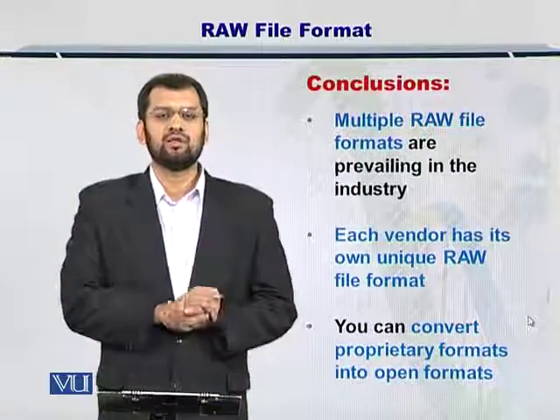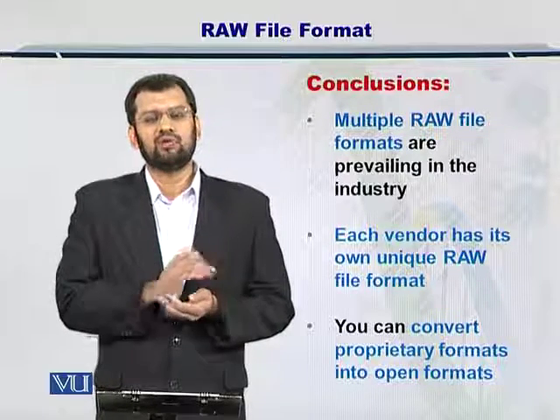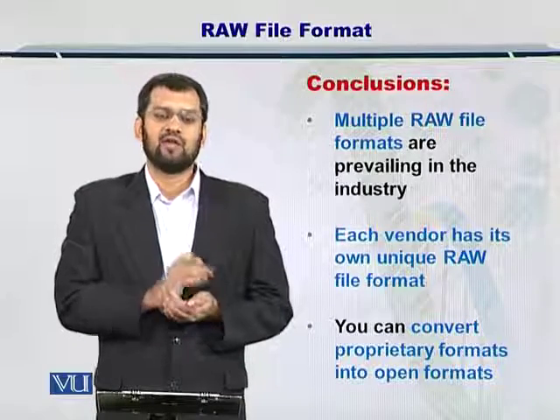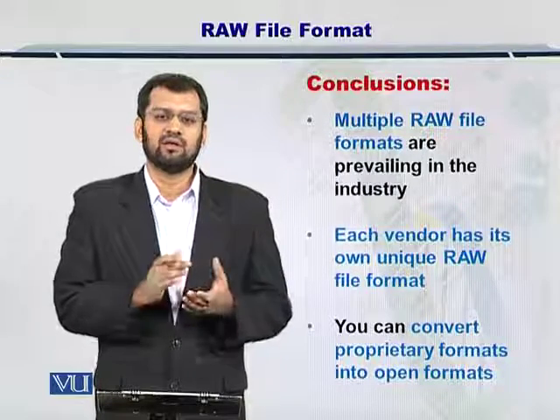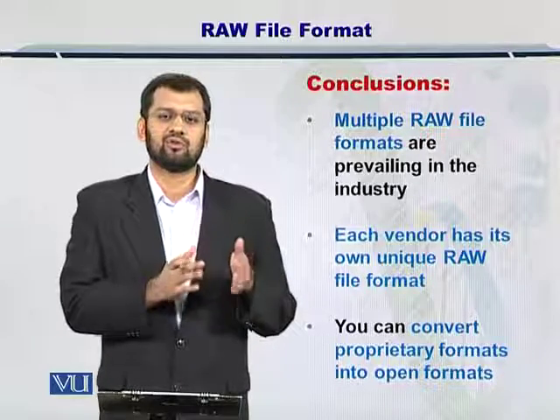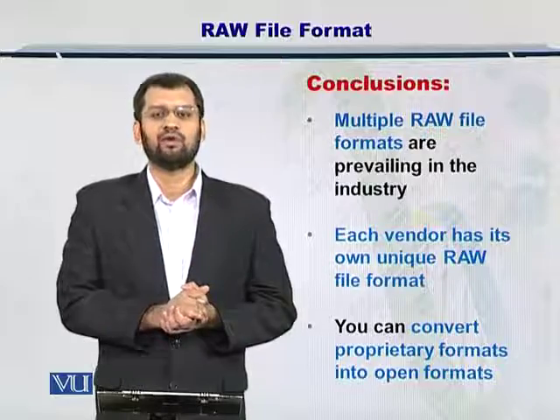Okay, in conclusion, multiple file formats exist and you need to convert these raw file formats into standard files. You can do that by just looking at some of the online tools that are freely available on the internet, and you can convert your specific instrument's raw data into mzXML or other open data formats.